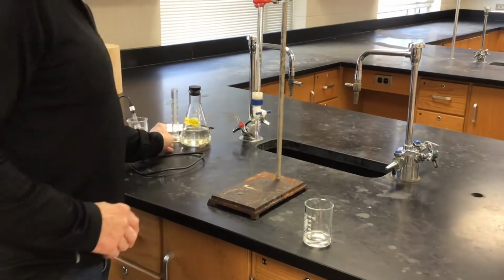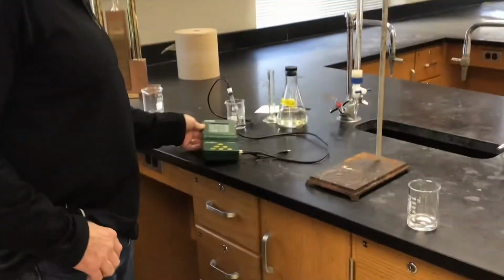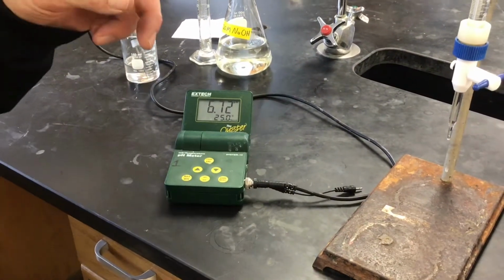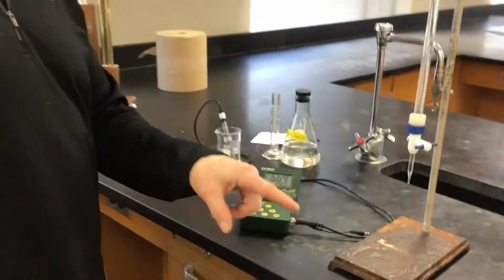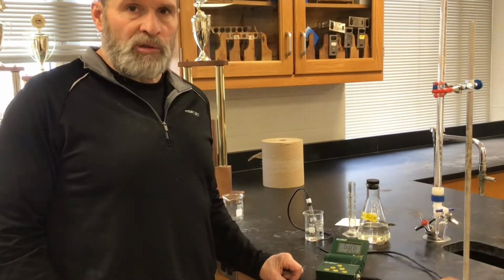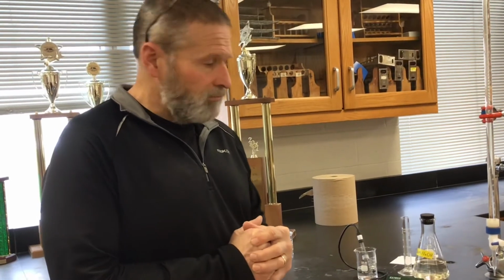And instead of using an indicator, like we did earlier in the year, we're using a pH meter this time around. So the idea is that we're going to add some NaOH, we'll record how much NaOH we've added, and we'll let the pH meter tell us what the pH of the solution is. So you're going to end up with data that is volume of NaOH added versus the pH in the beaker. Right, so in the lab write-up there's a data table there so you can record data if you'd like as we're creating.